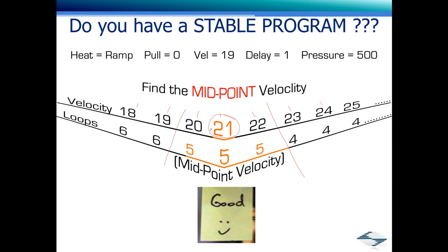You might want to consider this with the P97s because we are still making that puller, and we still have the parts, but eventually we'll be making the P1000 and then the next version puller, so it's good to jump on the opportunity to refurbish your P97 if it's over 10, 15, or 20 years old.